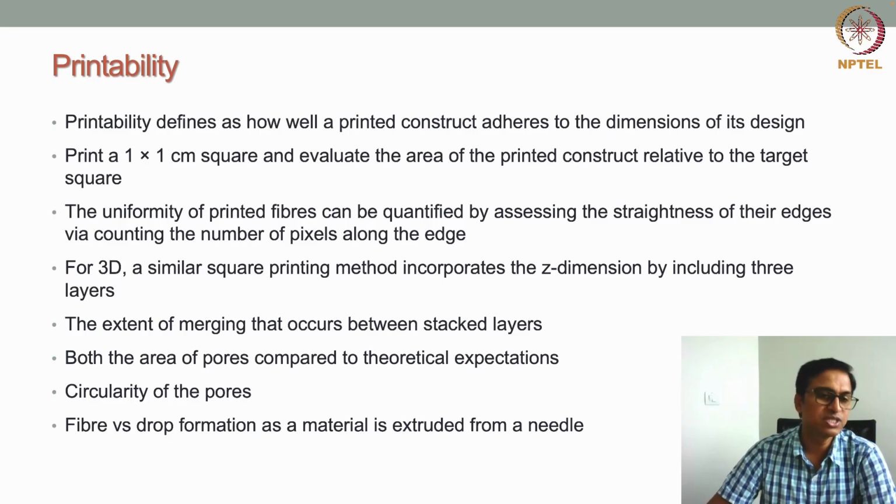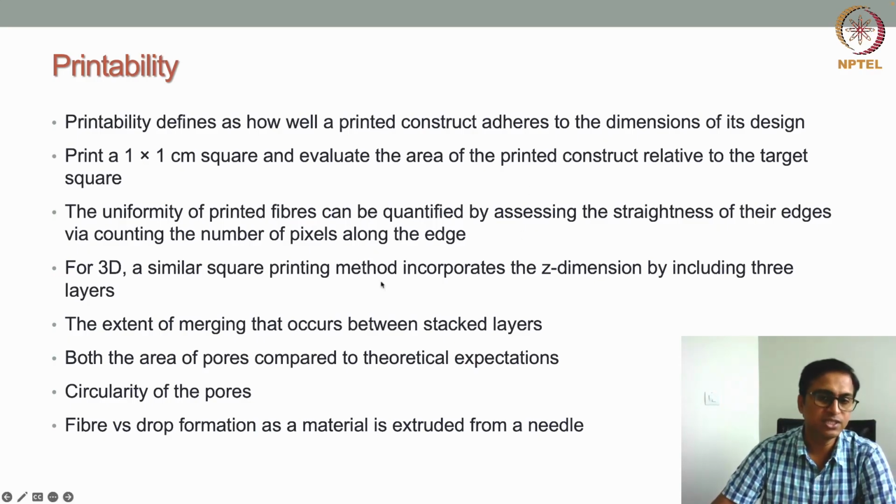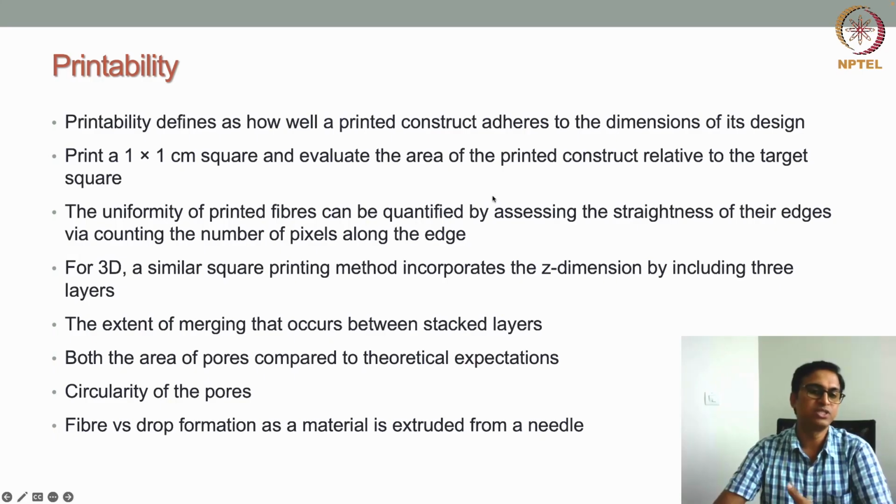This is how printability can be evaluated for a two-dimensional object printed with the bioprinter.